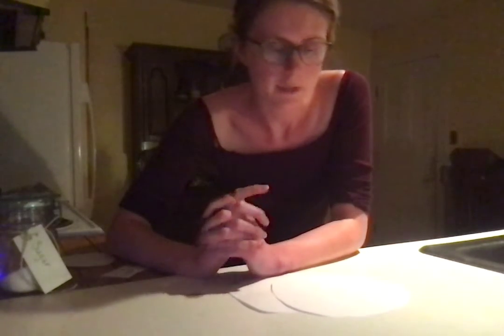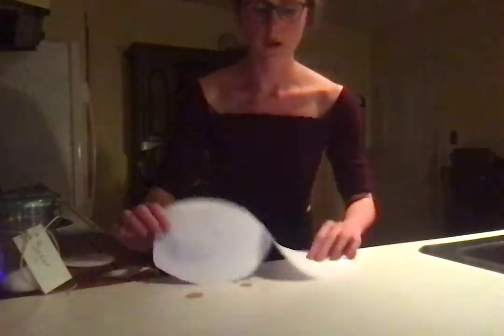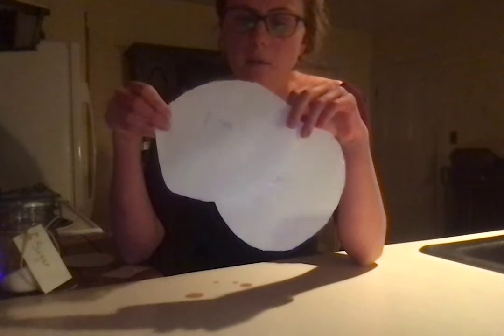Okay, so we are going to do an experiment to demonstrate bacterial transformation, and we're going to initiate this in our lab. We're going to start with 2 E. coli samples, E. coli cells. E. coli is not competent on its own, meaning that it is unable to let large molecules like DNA pass through the cell membrane. But we're going to conduct an experiment.